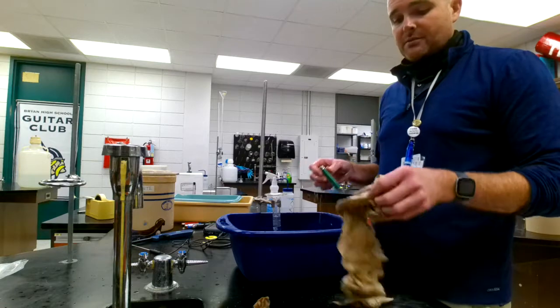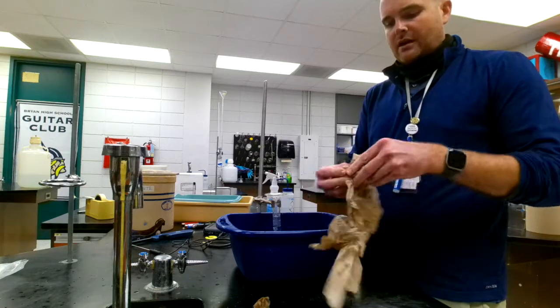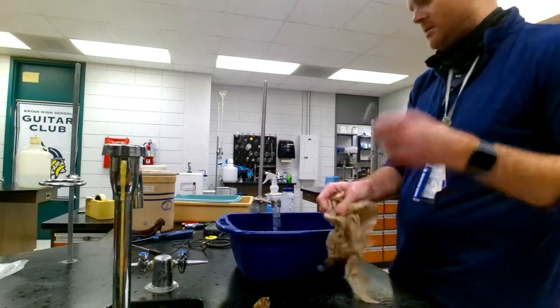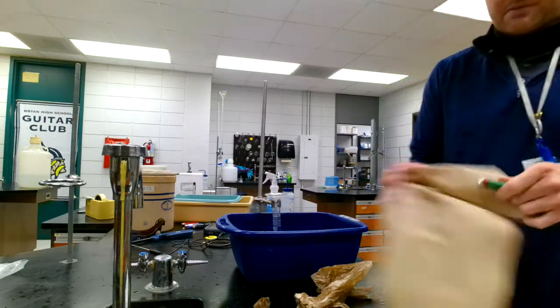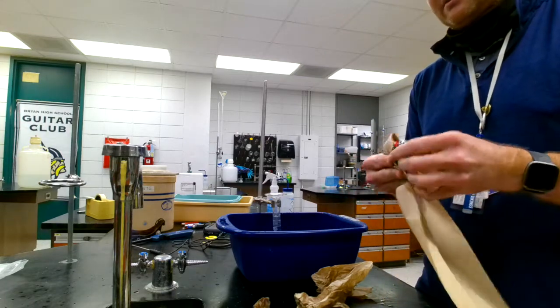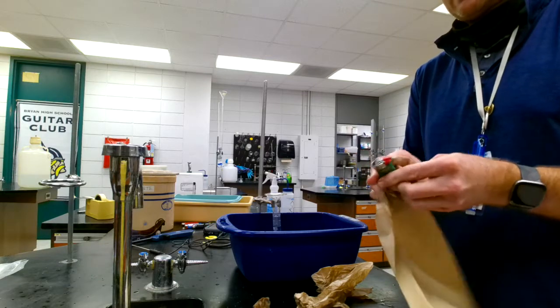Now, this lighter is wet, so it needs to get dried off before we mass it again. Sometimes water gets stuck in the top here, so we're going to do the best we can to wipe it down and not depress the little trigger here to release more gas, because that wouldn't be good.